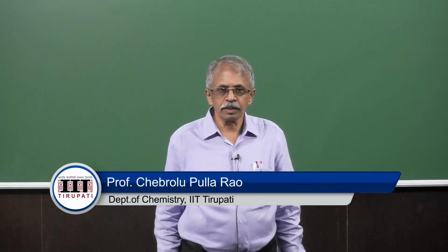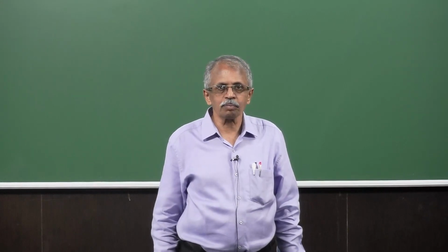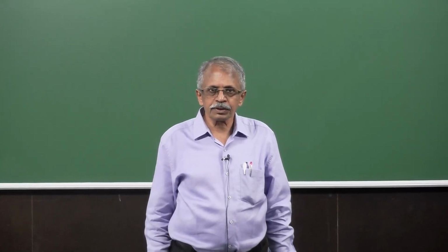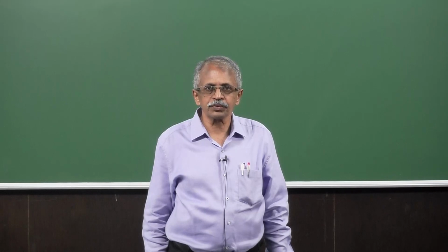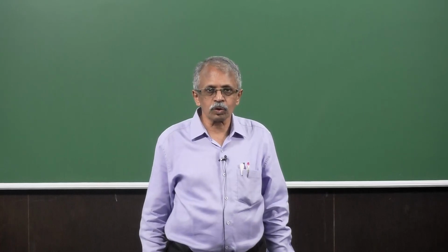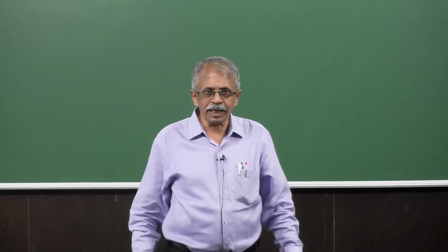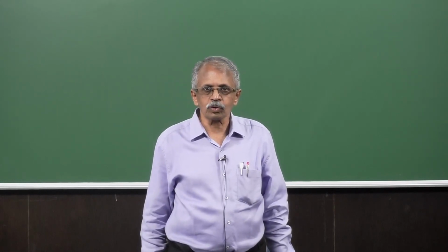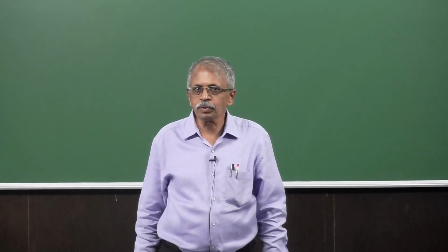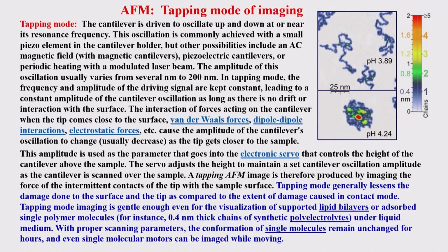Good afternoon. Welcome you all to this next class, this particular course in analytical, spectral and microscopy applications of inorganic compounds and nanosystems. For the past two classes, we have been focusing on the aspects related to microscopy. We've just gone through some general introduction to microscopy. Then we started with the atomic force microscopy, which comes under the banner of the scanning probe microscopy techniques. And we have looked at the principle, and we have been looking at some examples towards the end of the previous class. Let me just browse through those examples once again.